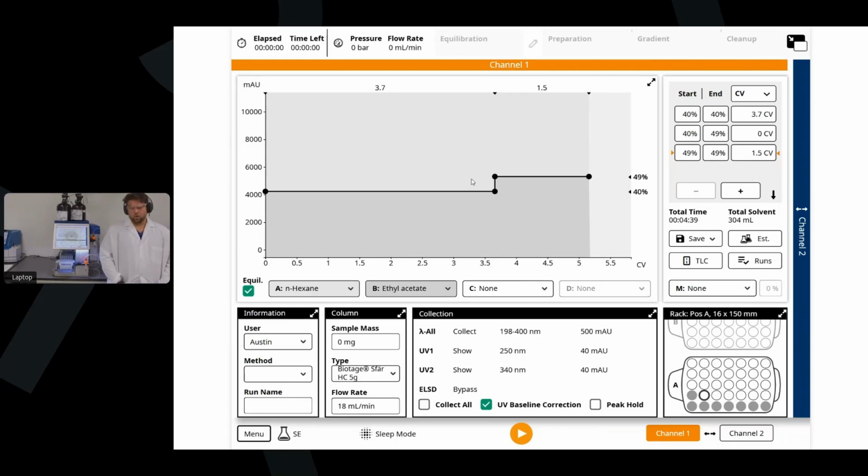Yeah, so one feature of the system is, again, you have that user lockout capability if that's something your lab wants. That way, any users that are more advanced and want to keep their results and methods separate from newer users, you can have that set up on the system. But I will say the Selekt system is designed to be very user friendly. So ideally, a new chemist is able to do similar things as an advanced chemist.